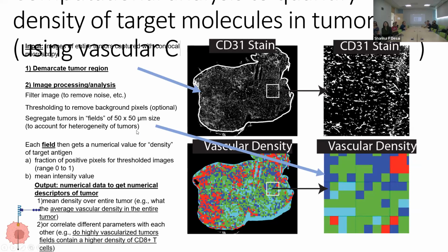The other thing I'm showing here is how I process the data. I'll go quickly over that because I'm always using my own environment to do this type of analysis. But still, you need a source image. That's still the key thing for me. I cannot write any code to take the image myself. I really need the microscope. The microscope has lots of features for doing analysis, I'm sure, but I do it myself. I'll just go through quickly.